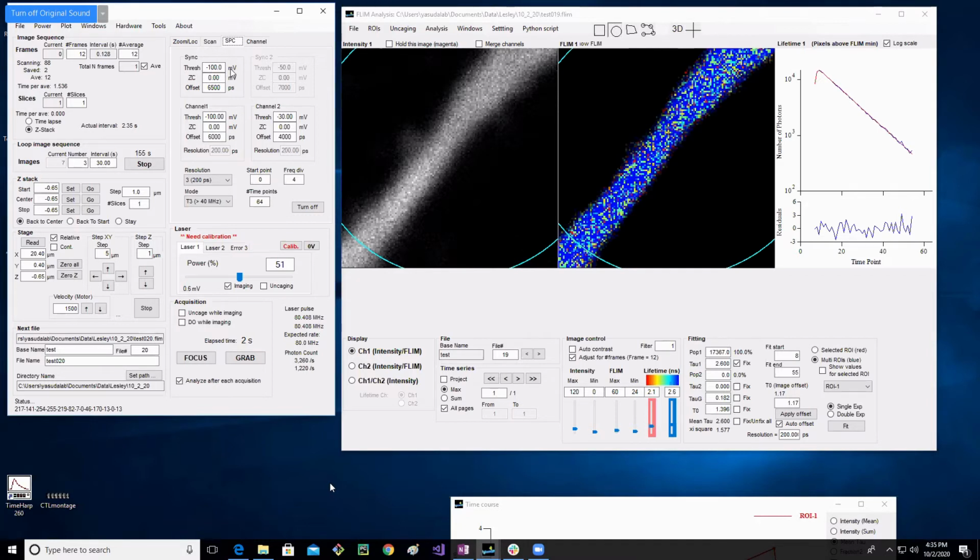If you actually looked at the electrical signal that's coming out of the sync cable in the laser, it's kind of messy looking. And you have to define, in that electrical signal, what threshold you're going to use to define it as an actual pulse. And if you set that threshold wrong, so I did my minus 100.